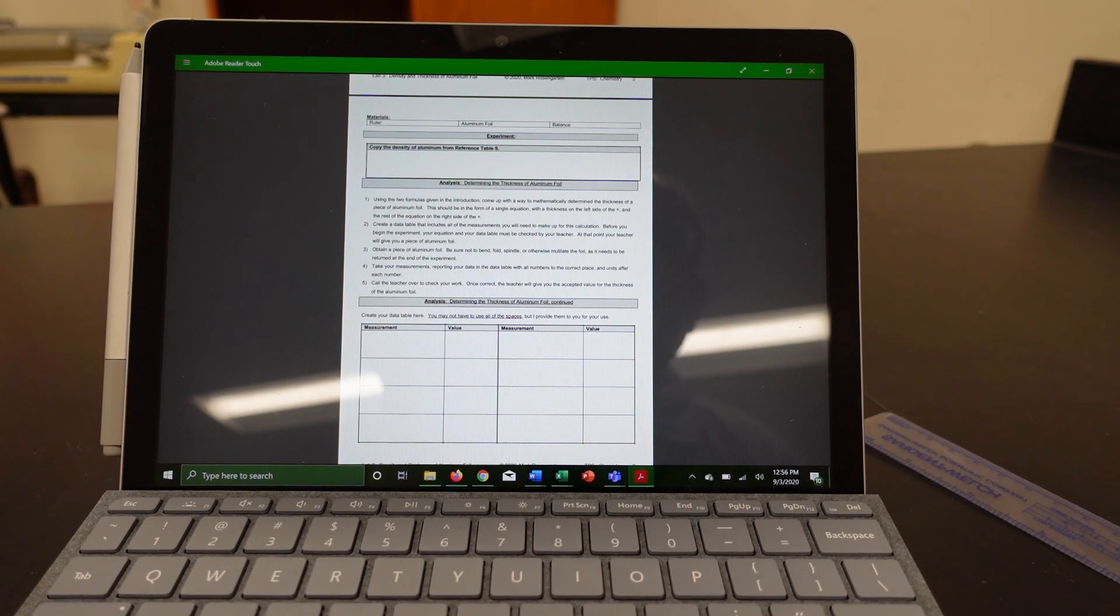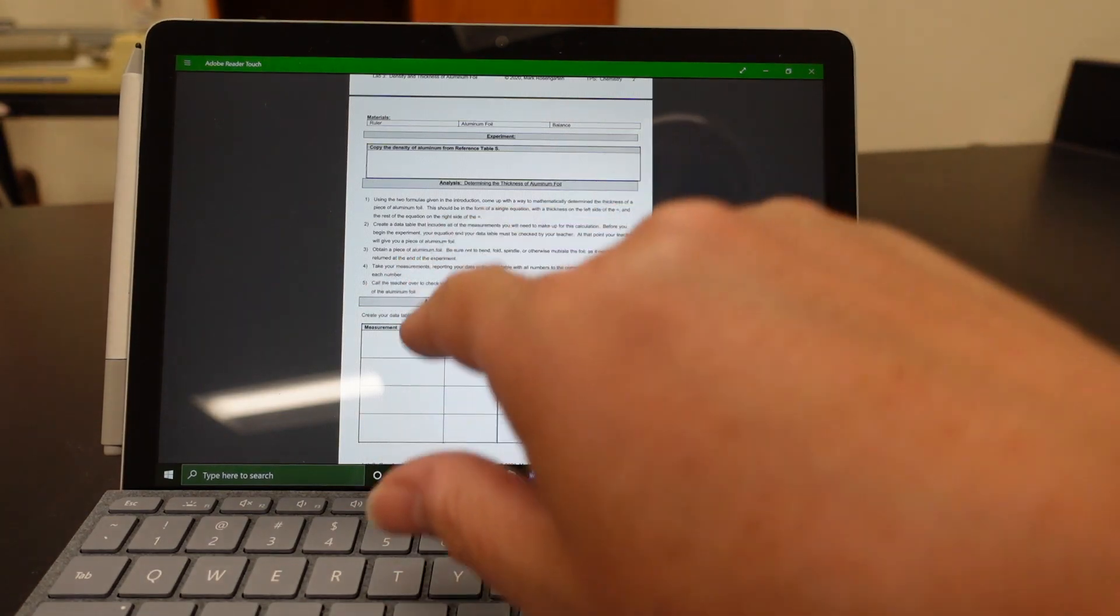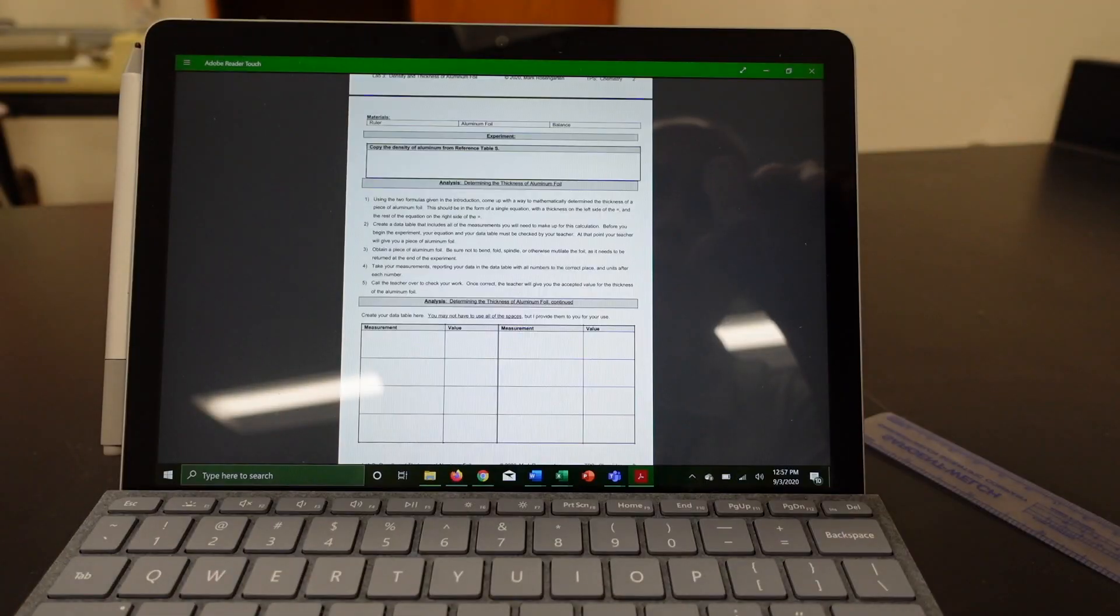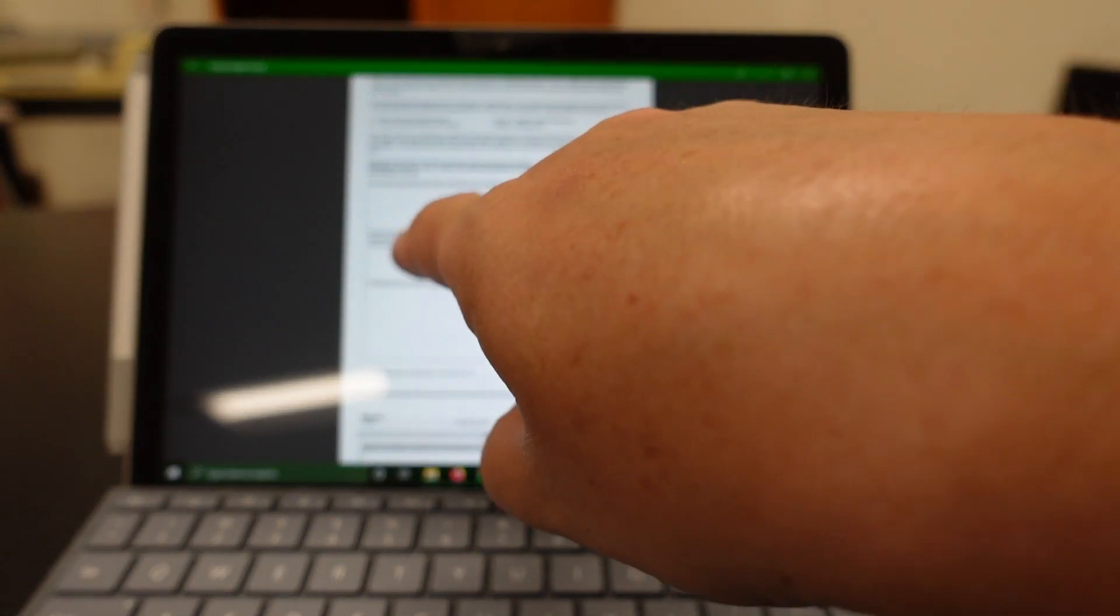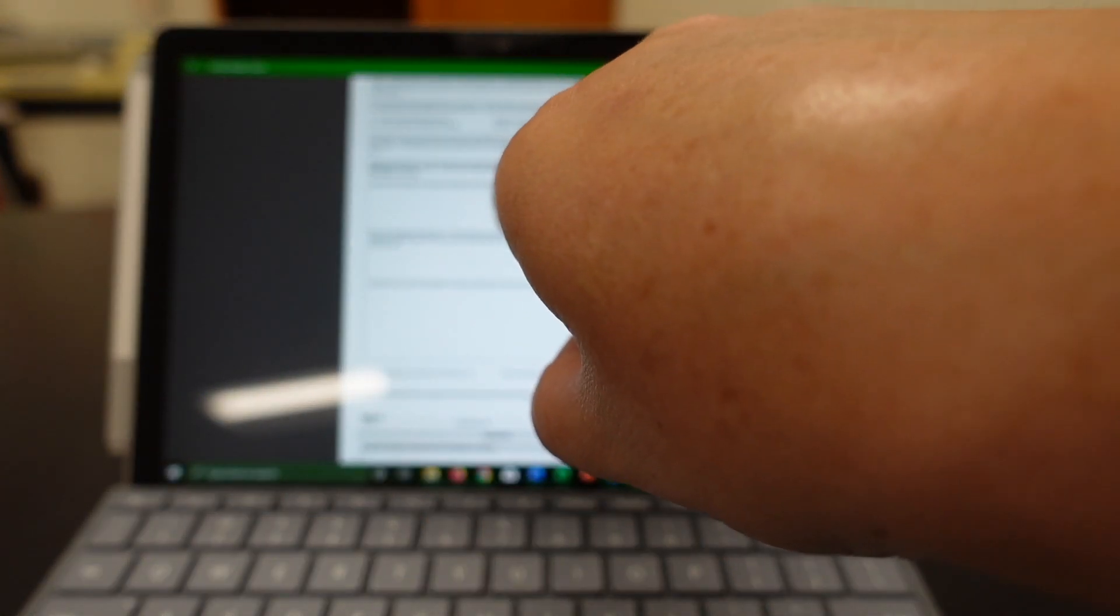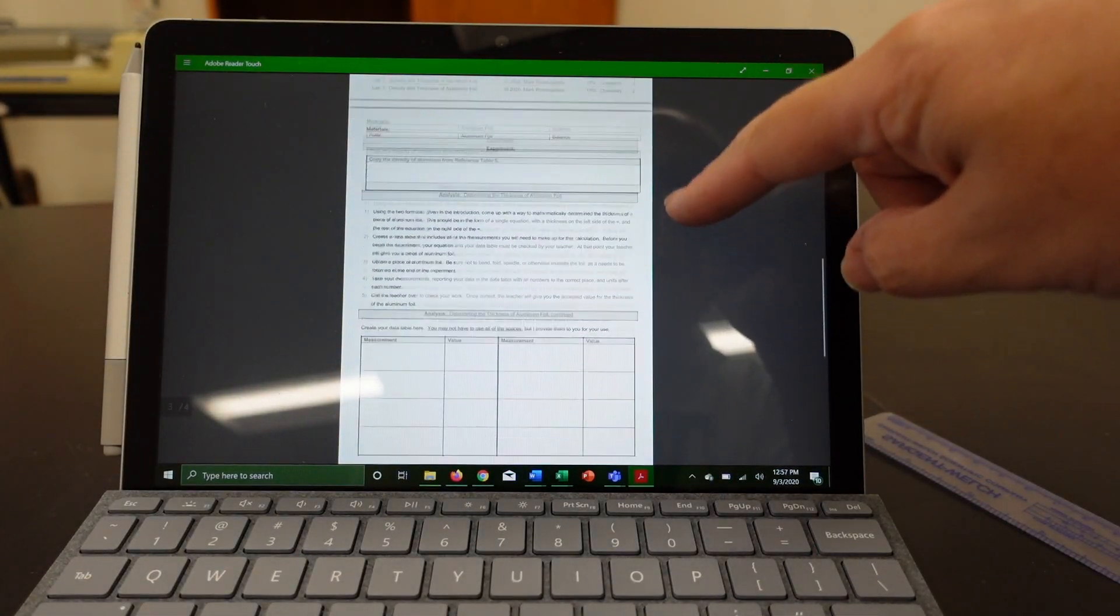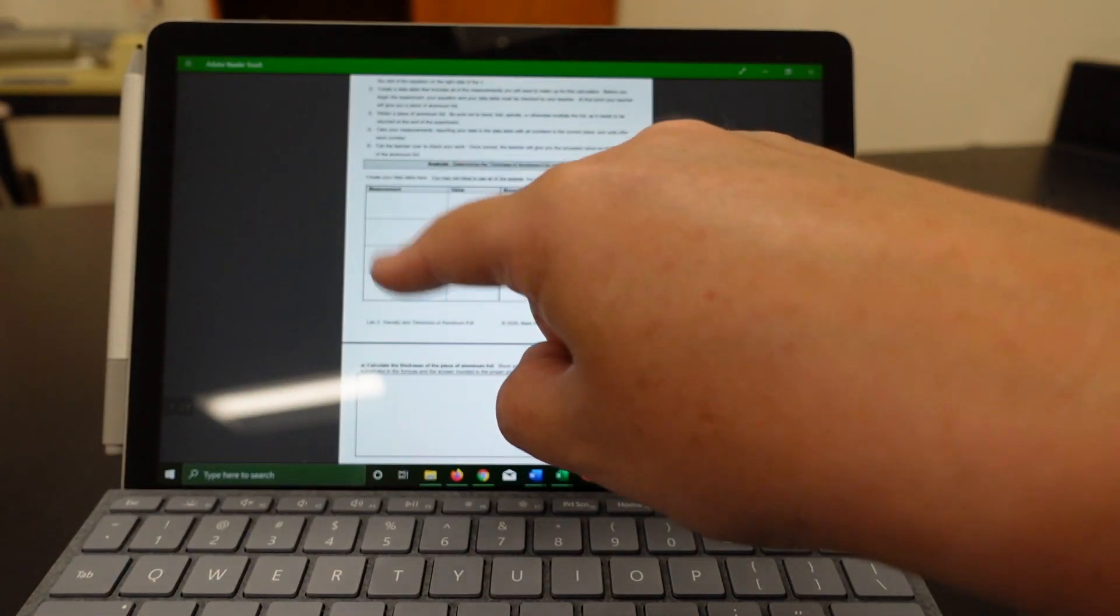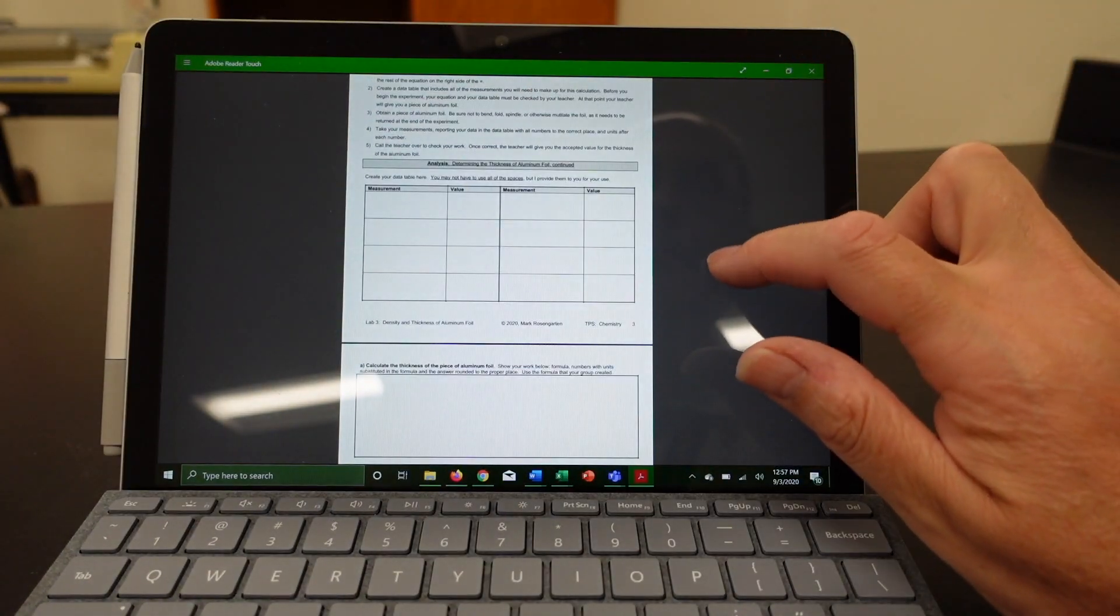Now using the two formulas given in the introduction, come up with a way to mathematically determine the thickness of a piece of aluminum foil. Now here's the thing. I have a whole bunch of spaces here for measurements. You already told me here what measurements you'll have to make. So based on the measurements you decided to make, copy those down to this data table. And then we'll go through and actually measure them.